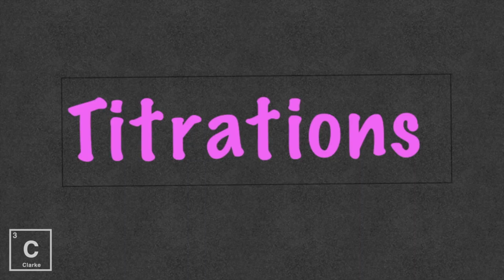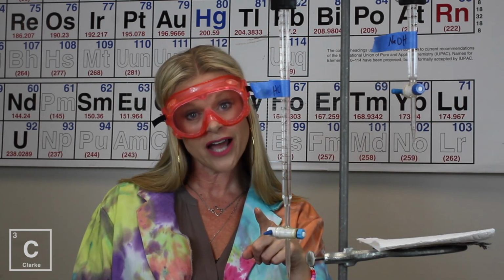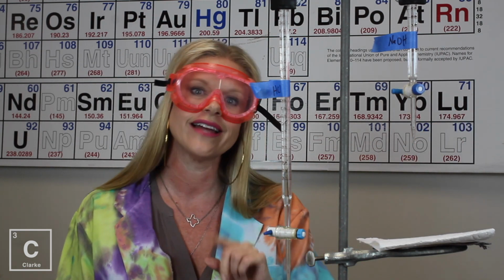We're gonna do a lab. This is the final lesson in a series about acids and bases. I am gonna teach you about what a titration is. A titration is a lab process mixed with math. So, the lab setup. Grab your notes, grab your calculator, grab something to write with, and let's get started.